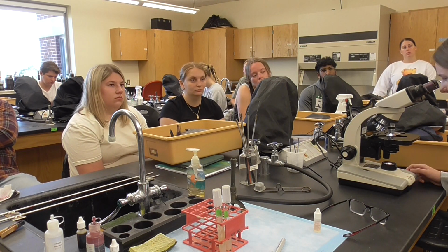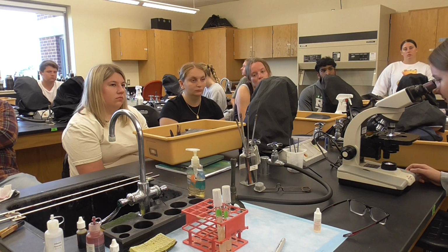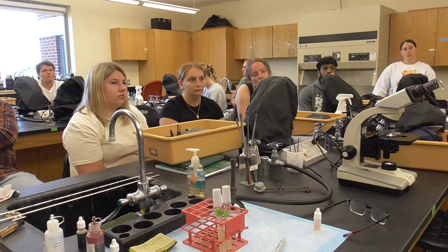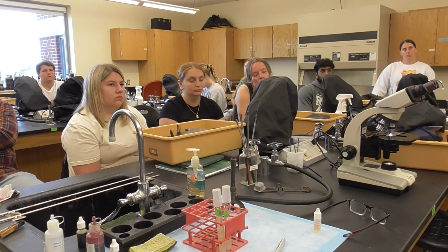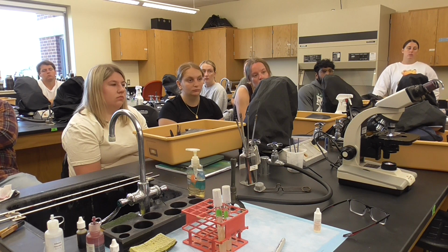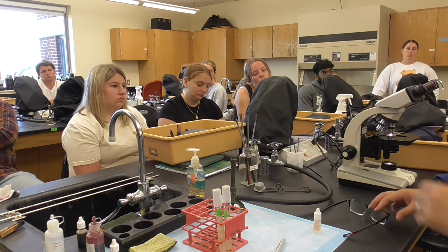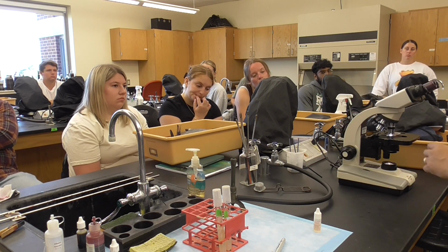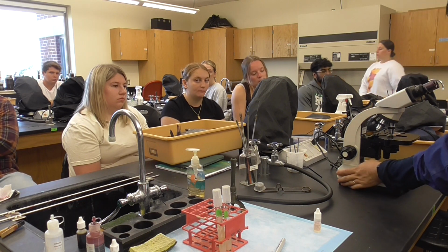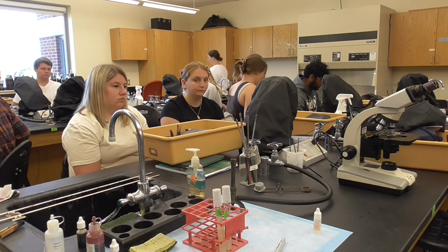That's why I want to tell you, every year there's some culture which is messed up, so you can find out what it is. And in your report, you should say lactobacillus is gram-positive, rods, E. coli is gram-negative, single rods. However, what we find is a little bit different. And what's the reason? It could be the cross-contamination of the slants. Every slant might be different. So that gives you good practice to see what it looks like. Okay, that's good. That's what we have. So today's work.